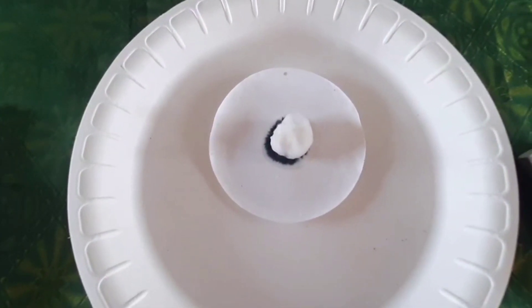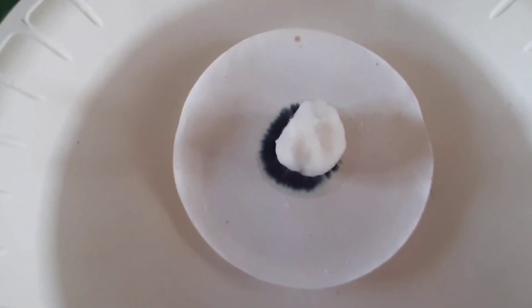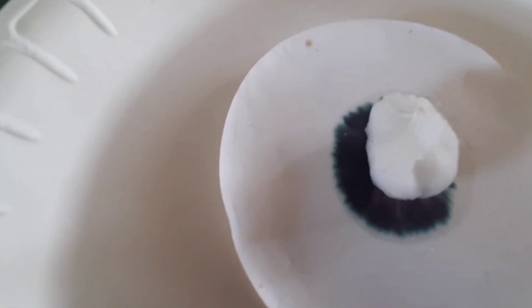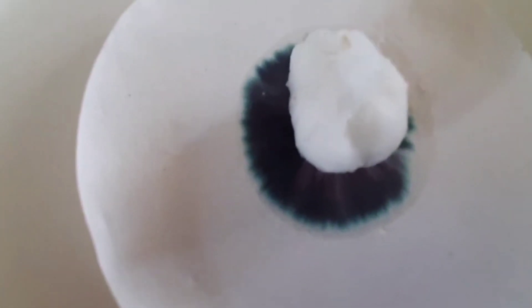The black ink separates into its constituent dyes. As the solvent moves up the paper, the dyes are carried with it and begin to separate. They separate because they have different solubilities in the solvent and are adsorbed to different extents by the chromatography paper. The chromatogram shows that the black ink contains three dyes.